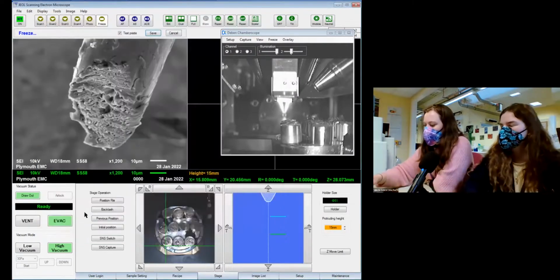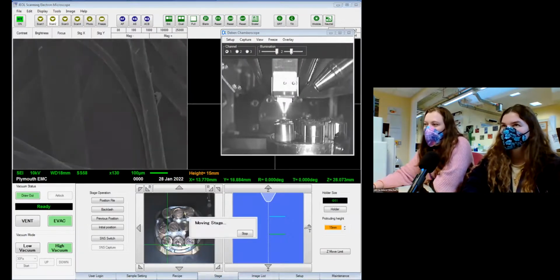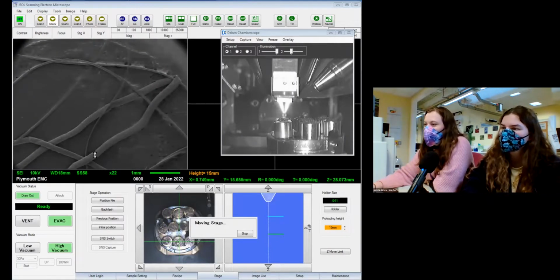Okay. Right. Cool. We'll leave it there for the pets, but instead we've got some samples from Dartmoor Zoo. So our first one is wolf hair, so we can do a direct dog to wolf comparison and see what the difference is. Wolf hair immediately is much coarser.